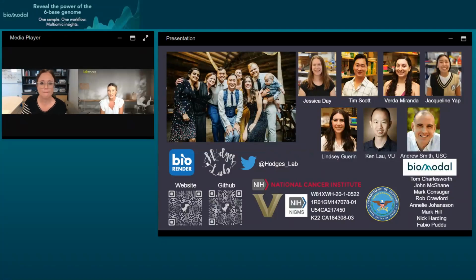Thanks, Emily. Our next question. Overall, how has the 6-base data improved your understanding of the relationship between epigenetics and gene expression? Yeah, I think we're only starting to appreciate that we need to consider these intermediate states. And of course, there are other intermediate states that we're not seeing here. We're not looking at the subsequent oxidation steps that get methylcytosine to unmethylated cytosine. That includes formyl and carboxyl intermediates that we're not observing here.